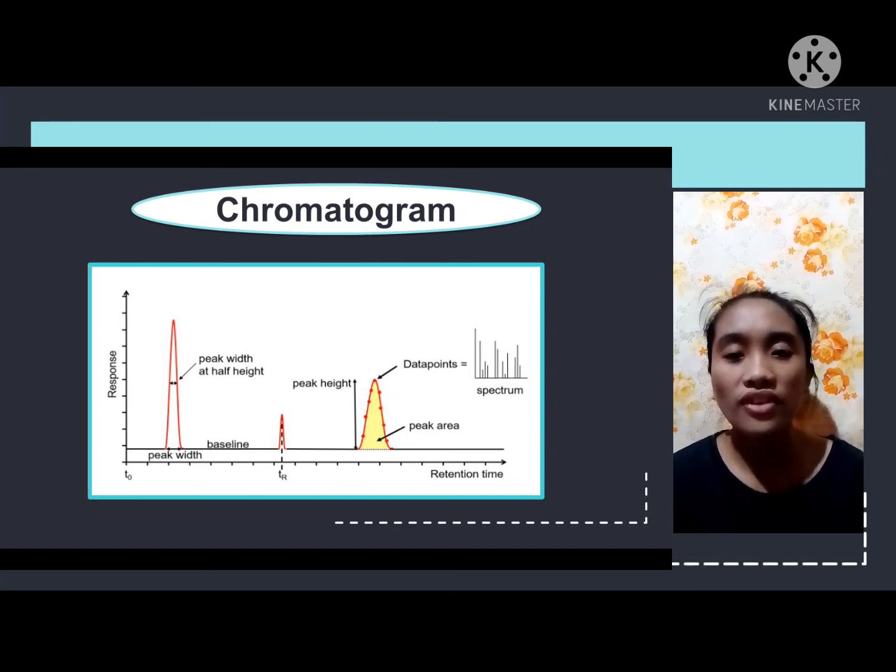Accurate measurements are affected by the number of data points across a peak, with an ideal number of 15 to 25. Too few makes the peak look like a child's join-the-dots drawing, affecting peak area, resolution, and GCMS deconvolution. Too many reduce the signal to noise, reducing sensitivity for GCMS data. Each data point is a mass spectrum, the third dimension of data.